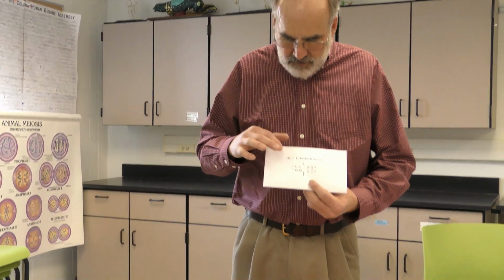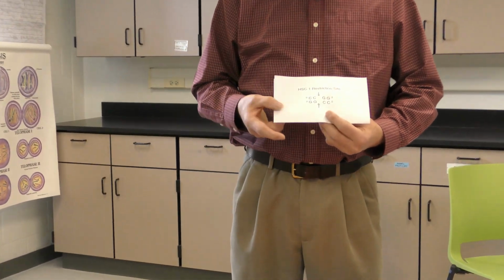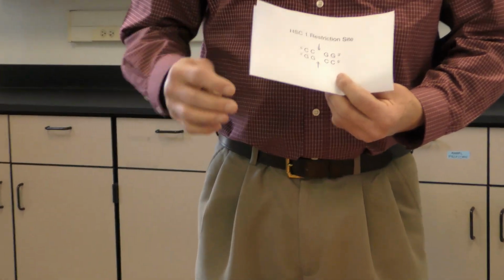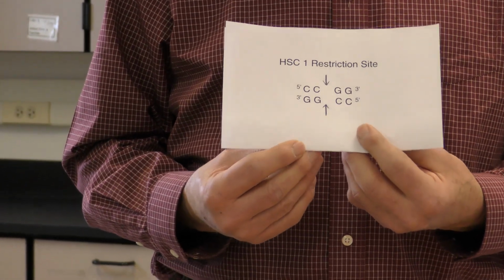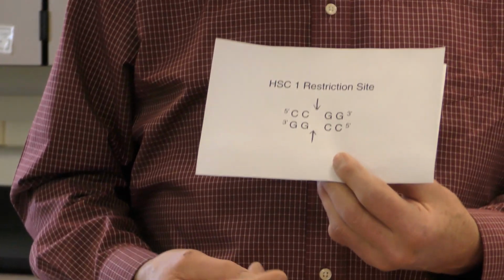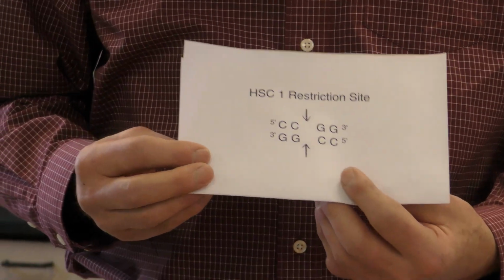This is a random restriction enzyme that we created called HSC1 restriction enzyme, Heartline Science Center 1. Remember, the recognition site is very specific for each restriction enzyme, and the recognition site where it will cut the DNA fragment is represented here.